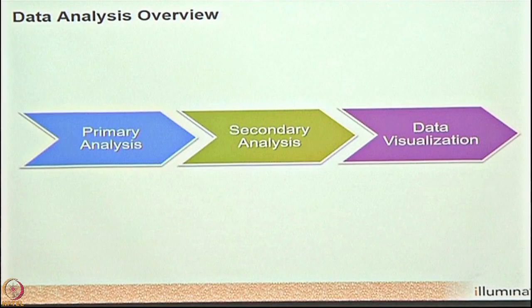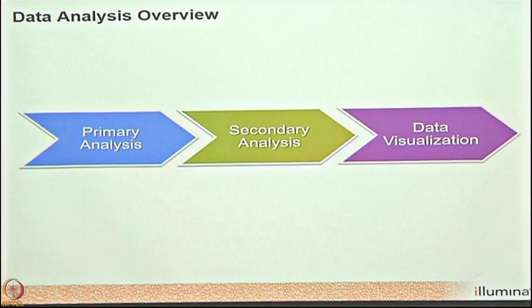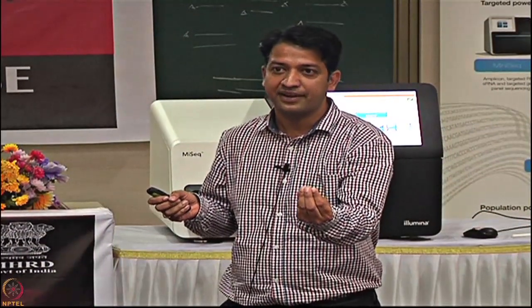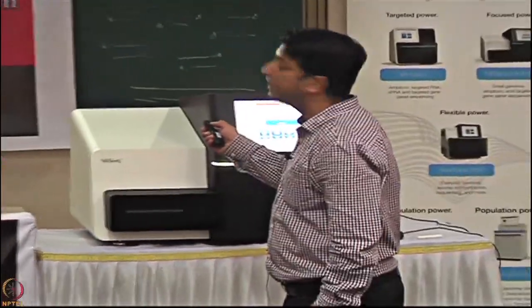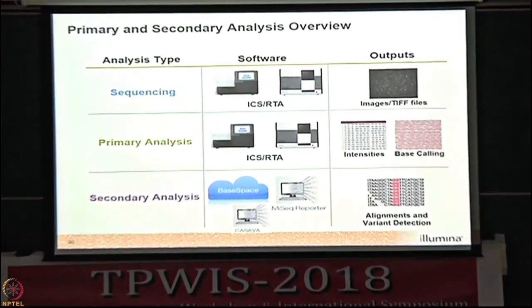So once we are done with the sequencing, the final stage is the data analysis. There are 3 kinds of analysis. First one is the primary analysis. During primary analysis, all the bases are tagged with a fluorophore, right? So initially, the camera will record the signals like this. It will be colored though: red, green, yellow, but these are all your bases called.